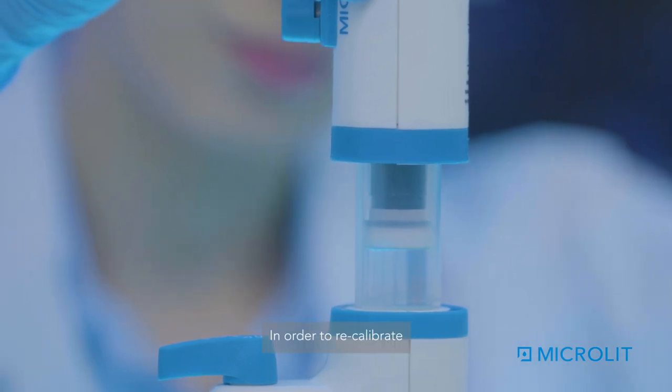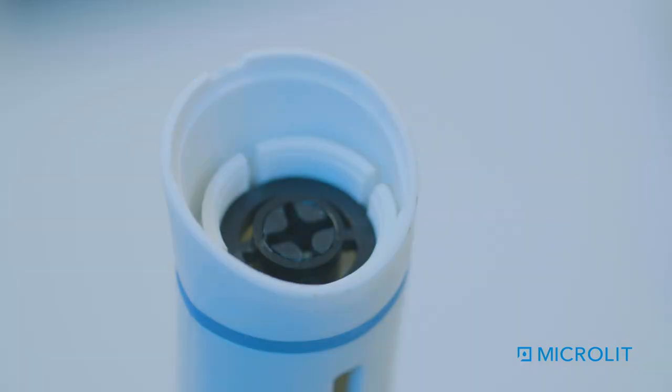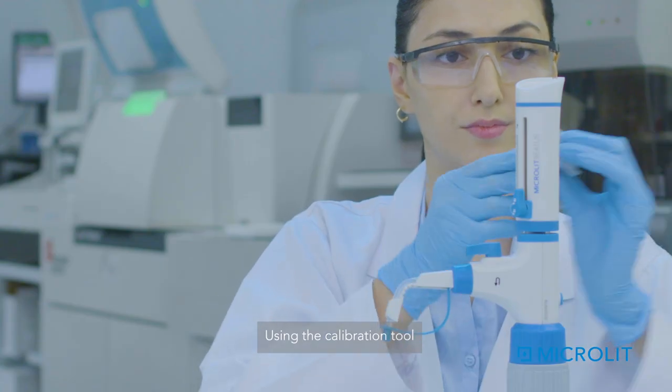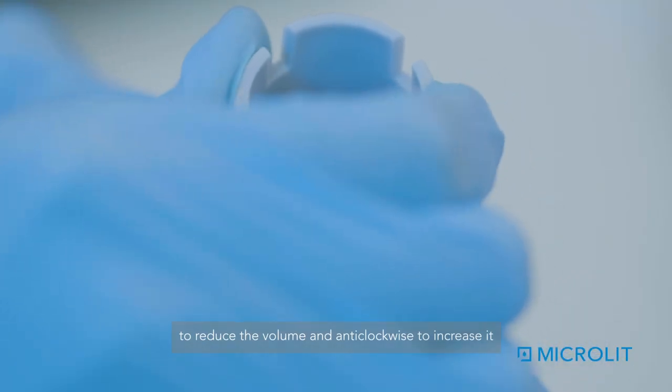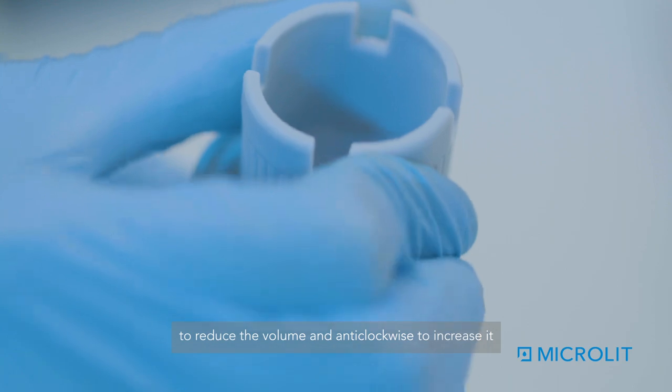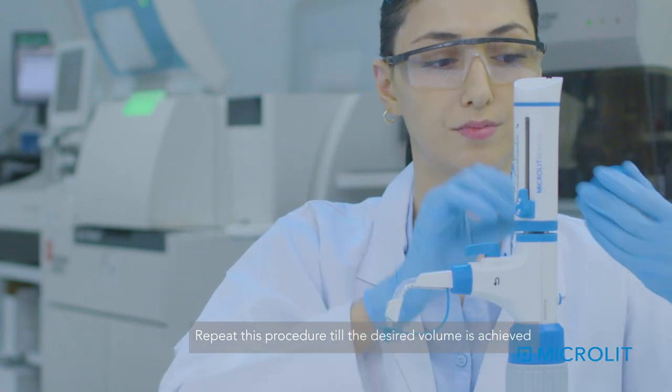In order to recalibrate, pull the cap outwards to expose the calibration nut. Using the calibration tool, turn the calibration nut clockwise to reduce the volume and anti-clockwise to increase it. Repeat this procedure till the desired volume is achieved.